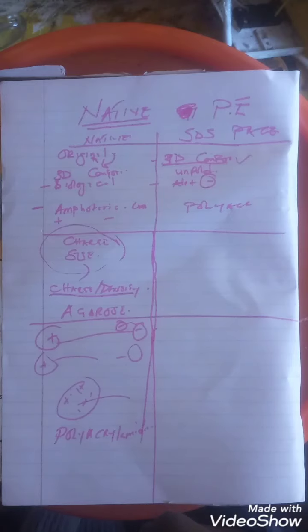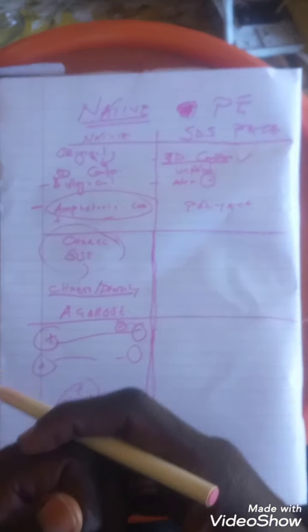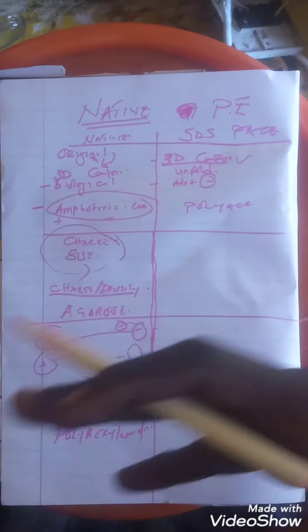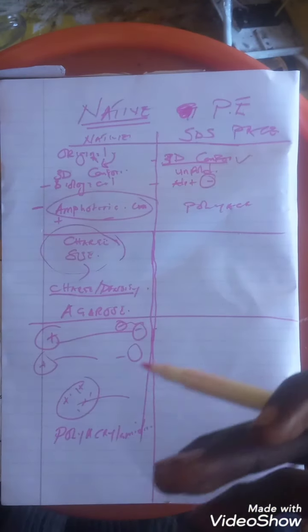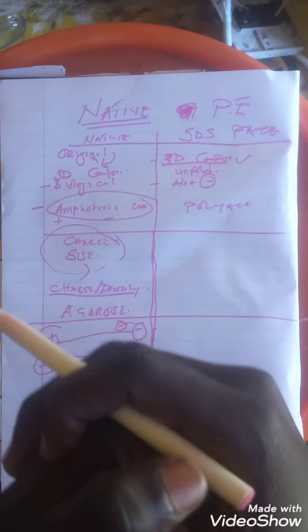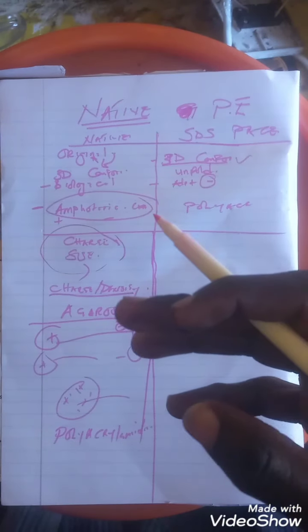And separation is again based on charge, where they keep their normal amphoteric charge. So some proteins will be negatively charged, some will be positively charged, some will be more positive, some more negative, and when an electric field is applied to them, you expect proteins which are negatively charged to migrate to the positively charged anode.